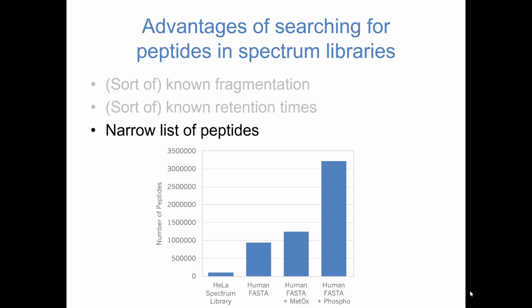So we're talking about an order of magnitude increase in the number of peptides that we're looking at. For adding a single met ox, only a single met ox, not multiple oxidations, that is a fairly significant increase, like a 20% increase in the number of targets you have to look at. And if you were trying to think about human phosphopeptides, that is a much more staggering search space.